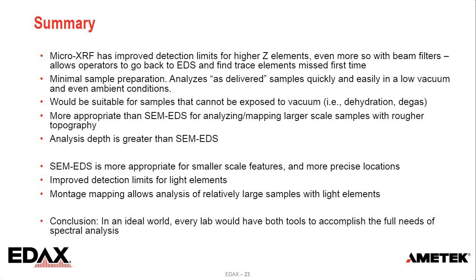Next question is, what's the typical energy of the X-ray used here? So for the Micro-XRF examples, we used 45 kV. And for the EDS analysis, I think most of them were 20 kV.